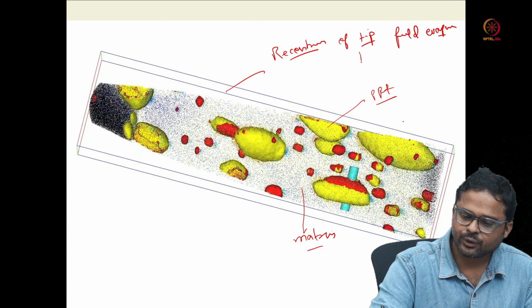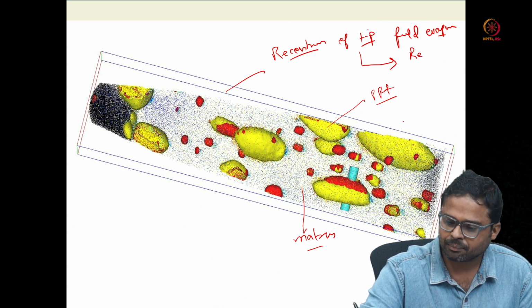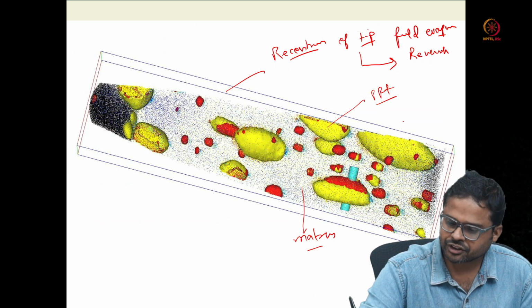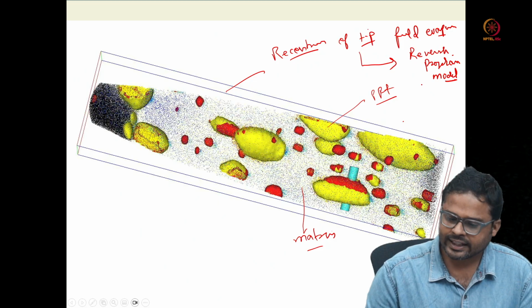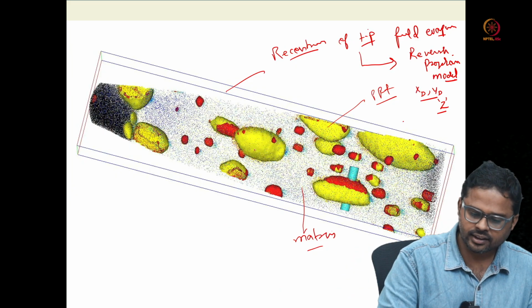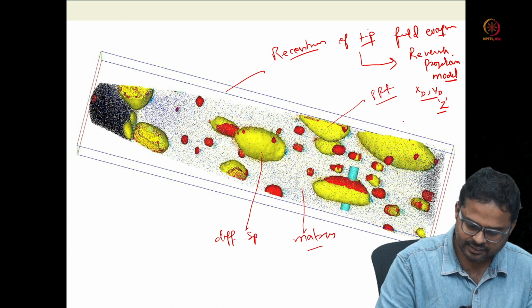As I told you, most of the reconstruction is done by the reverse projection model. You will get the information of the XD and YD position, and also the Z depth. All the colors correspond to the different species.